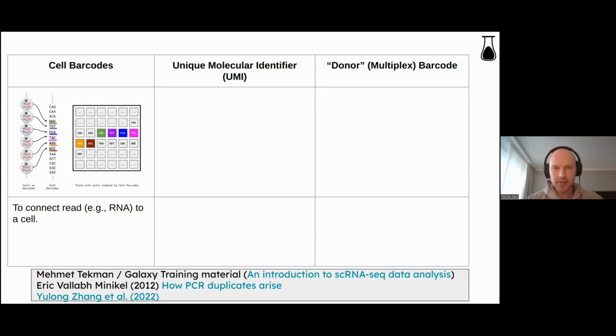One point I add here, which is important to know if you read the literature: quite often in the literature they don't speak about cells so much anymore, but about barcodes, which is a bit confusing if you come from the bulk sequencing area. Also in bulk, you know that you have different barcodes, but in single cell papers, if you hear about barcodes, quite often what they mean is the cell barcodes. So what they are talking about quite often is the individual cells.